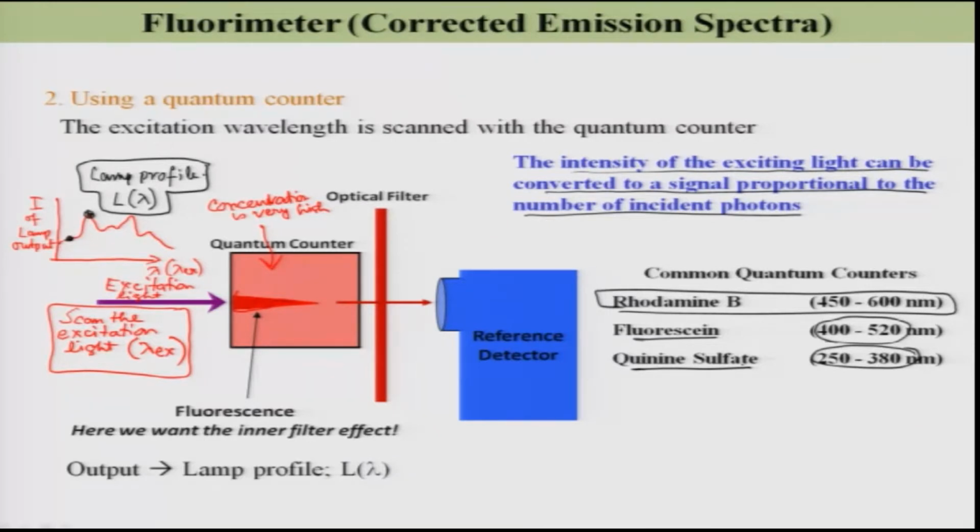Okay, so hopefully you understand how to correct the emission spectra. Whenever you use fluorescence spectroscopy in your life, please remember that we should report the corrected emission spectra, not just the simple emission spectra.